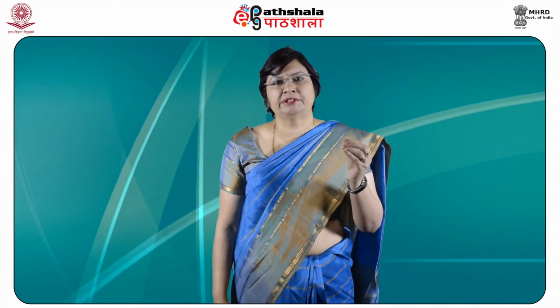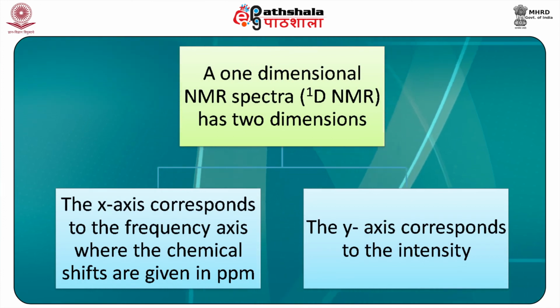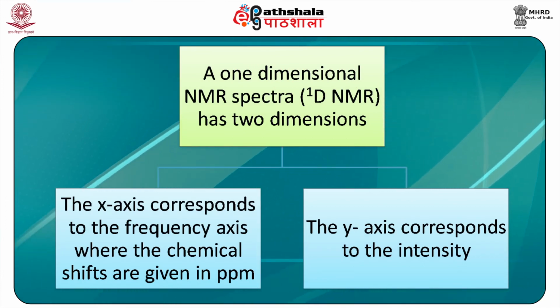The multi-dimensional NMR spectrum, like 2D NMR, provides increased resolution and correlations are easy to analyze. A 1D NMR spectrum has two dimensions.